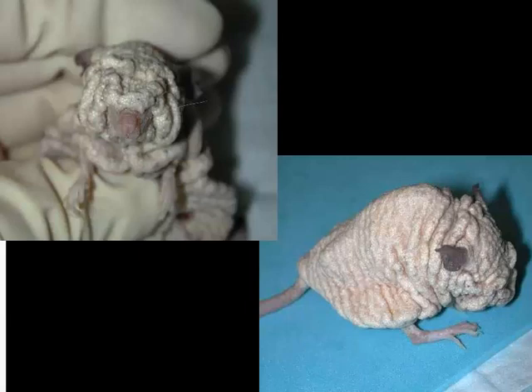I think the most appropriate morphologic diagnosis would be diffuse follicular dyskeratosis with cyst formation.